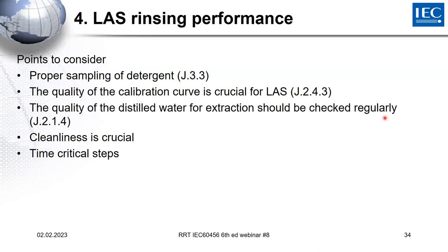So it's important to check every batch for residuals in the distilled water, because these ion exchangers have something inside which may absorb in the range where we are measuring. So that is, from my point of view, very important. And in all the round robin tests we had on the LAS method, it was one of the crucial points. Yes. Thank you, Markus.